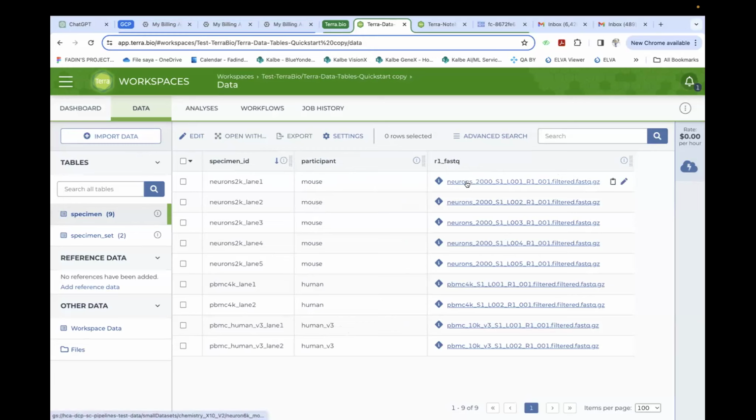This is the most important because it links into other cloud storage that contains the data sets. In this file, we use FASTQ files. A FASTQ file is the raw read output that comes from whole genome sequencing machines. It is like the very first data that we may be working on, because it is the fresh output from the sequencing machine.